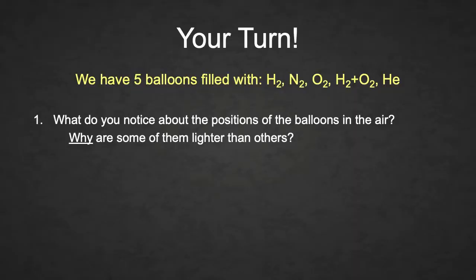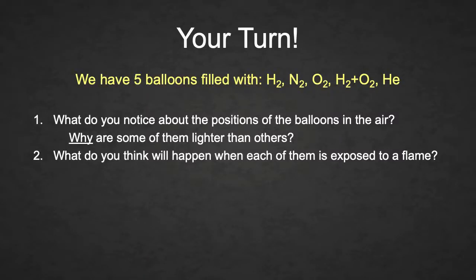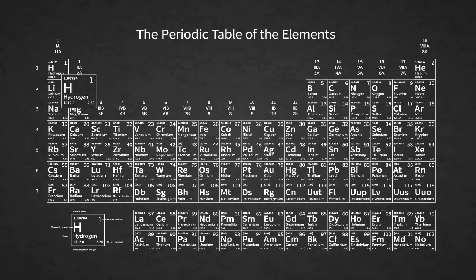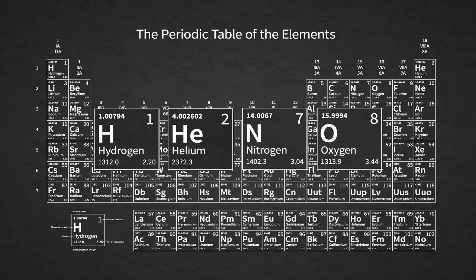Another question that I'd like you to address is, what do you think will happen when I expose each of these balloons to a flame? Do you think that there will be a combustion reaction in each case? Do you think there will be no reaction? And why? Another question I want you to think about is, how do you think the structure of the molecules themselves affects the reactivity? Do you think they're related in any way? Do you think the number of covalent bonds that are present, or the position of the atoms or molecules from the periodic table, affects how they're going to react?